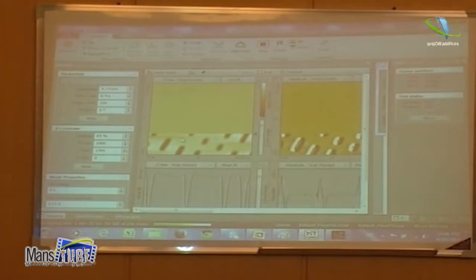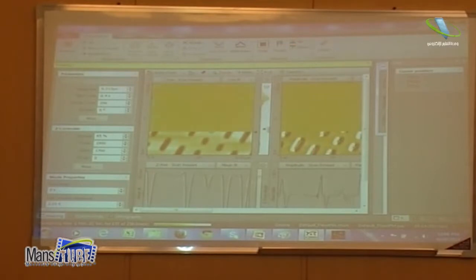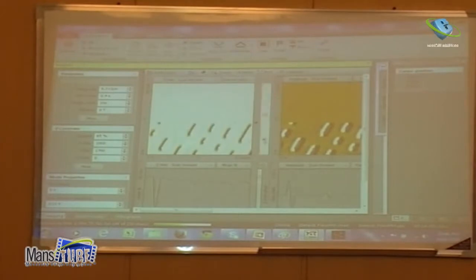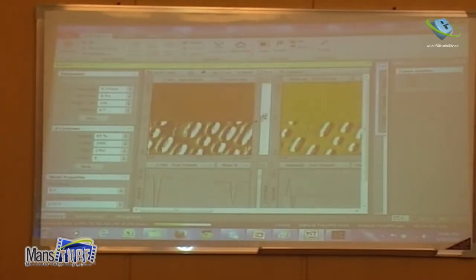Yeah. I see this is very small, very small. No, it's still very small. The one on the right is more visible in the amplitude. One moment. Now you can see. You see? Here on the computer we see it better than on the screen. On the phase it will show. Okay. You see it now maybe there? It's here.